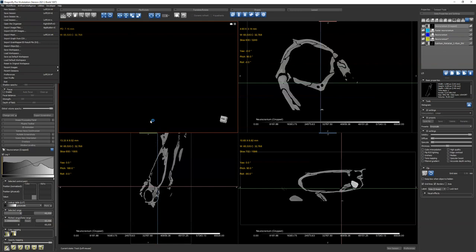So if you go, see here, we'll look at some of our things. We have different kinds of files. This is the file I'm working on right now, which is a session. When I last saved it, I only had the one volume and it was 27 gigs. So as you add things, it will add to the size of the session. Right now this session exists as a 27 gigabyte file. So if you segmented, let's say, 5 different complexes of the skull, would it ever become larger than the 27? Yes, if you have volumes.